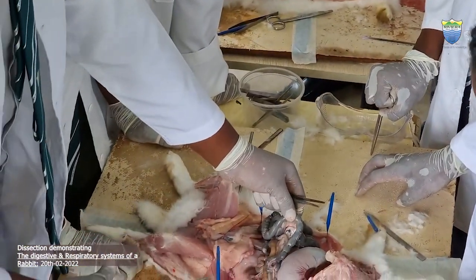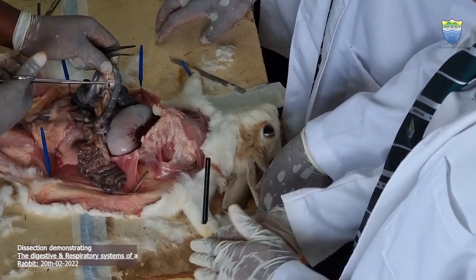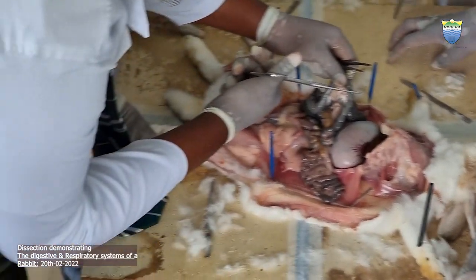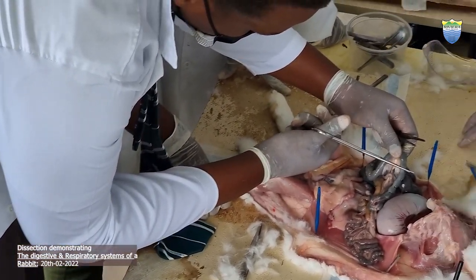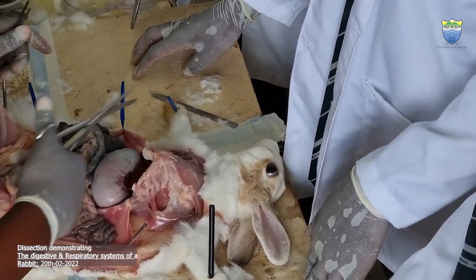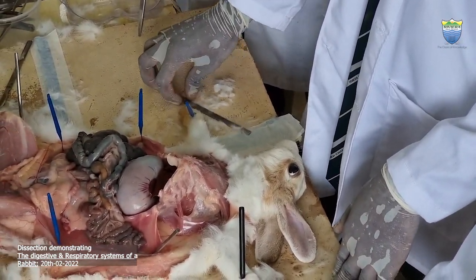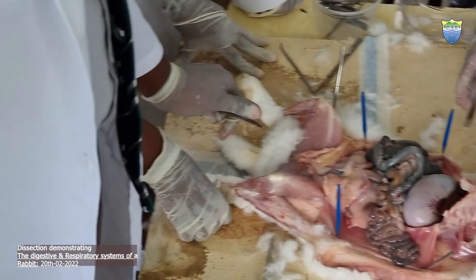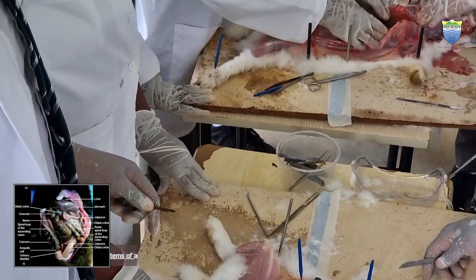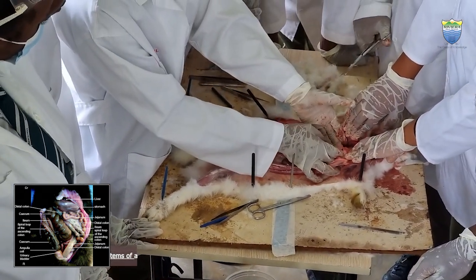Furthermore, as you come to the small intestines, the vessels are responsible for absorbing the food from the ileum. The nutrients are taken to the body and transported to the rabbit as a whole, as in any other animal. When we come to the upper parts, on this part of the stomach, we also have the liver, with the gallbladder. And here up, we have the lungs.